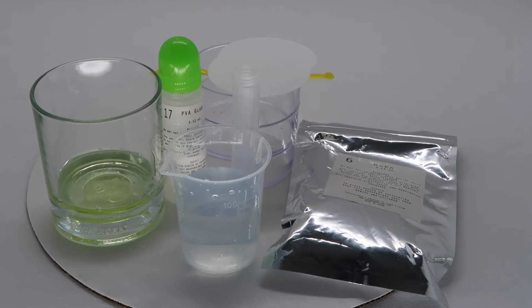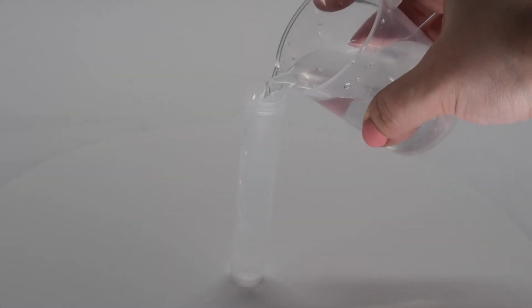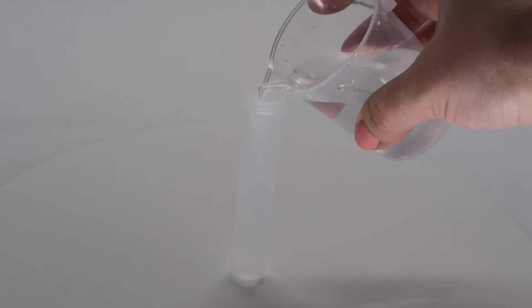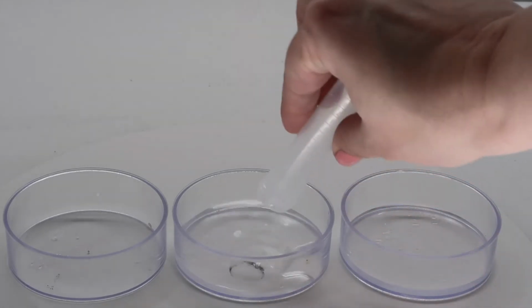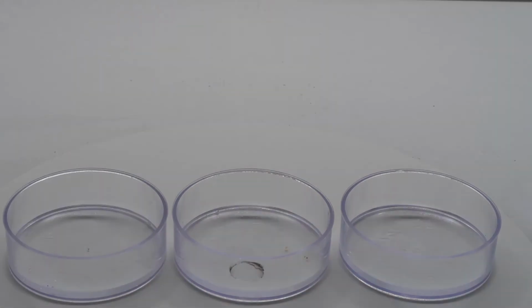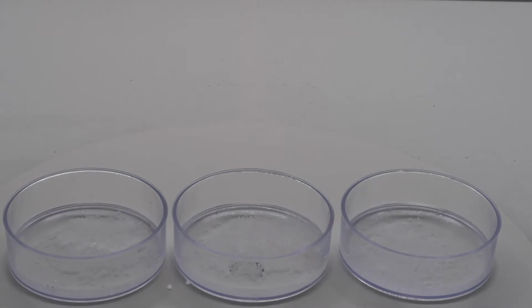Directions: measure 15 ml of water into the test tube. Next, pour into each petri dish 15 ml of water. Next, put 5 spoonfuls of urea into each petri dish. 1, 2, 3, 4, 5. Make sure the urea is dissolved.